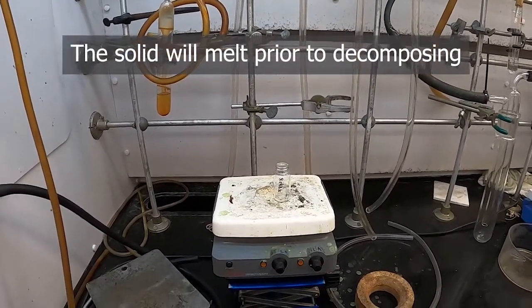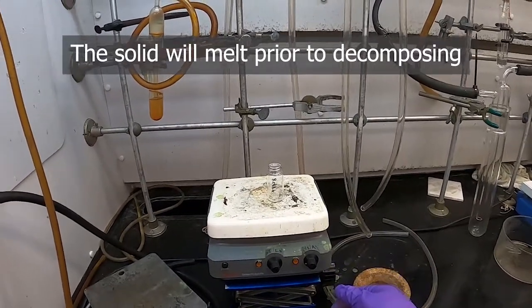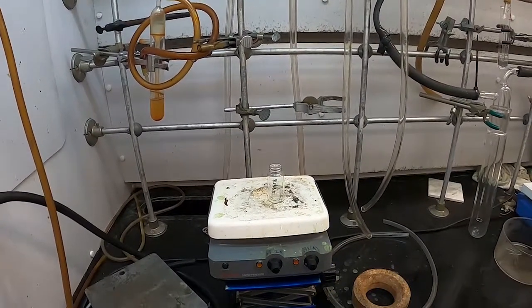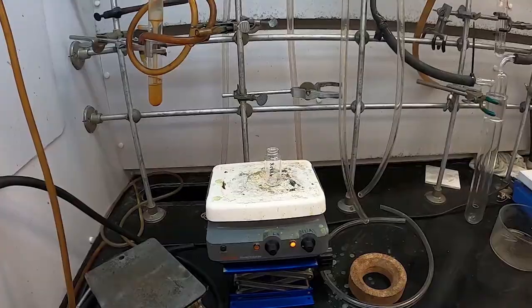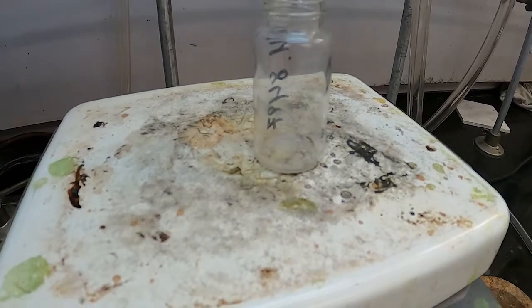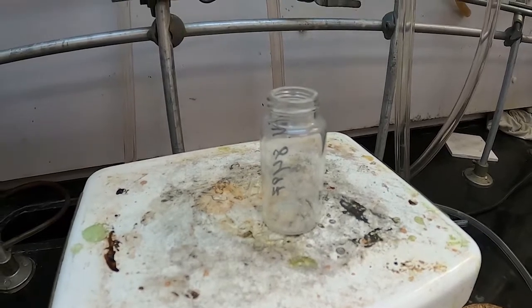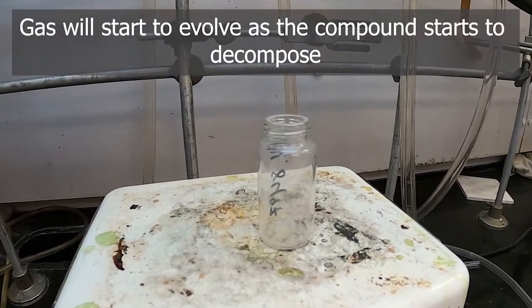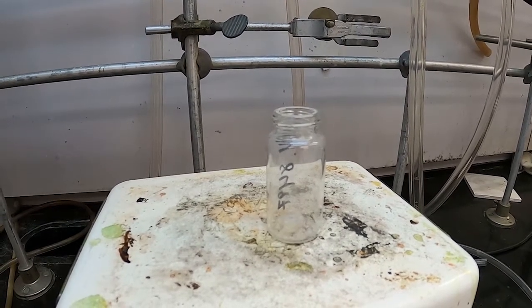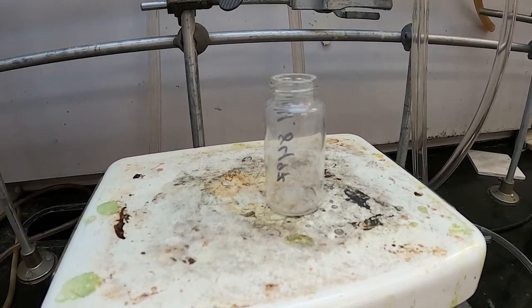So the compound has melted now. You can barely still see it even in the vial at all, so we should be getting close to where it will start to release some gas. I'm going to turn up the heat just slightly. See if we can get this to go. Here's a better look. You can see it bubbling there in the vial, and I can see some vapor, some kind of smoke, coming off the top there. It looks like a solid crystallizing again on the lip of the vial.